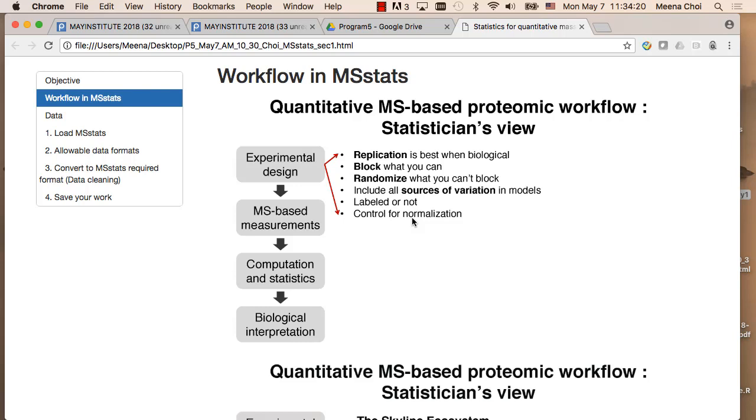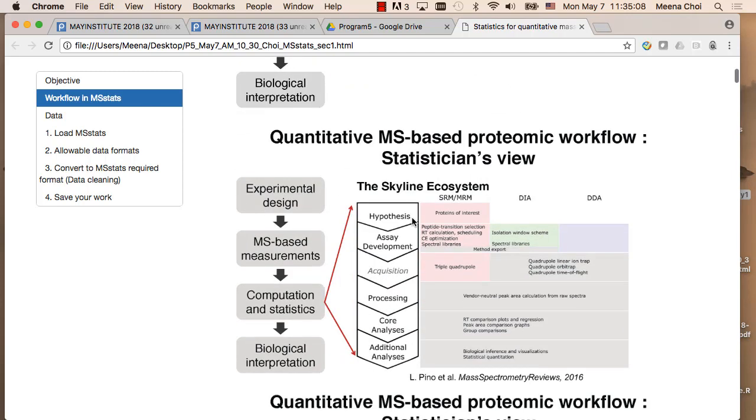One example is that they already have an experiment, one batch, and after one year they want to do something similar, but they add more samples and want to merge this data. How? This is most likely impossible. This is really difficult. So in these cases, we need to think about how we are going to normalize these two data sets. So I ask, do you have any repeated measurement between the two batches? Or do you have any repeats of the standard? You need to think about this kind of standard protein or peptide. This is the most important part.